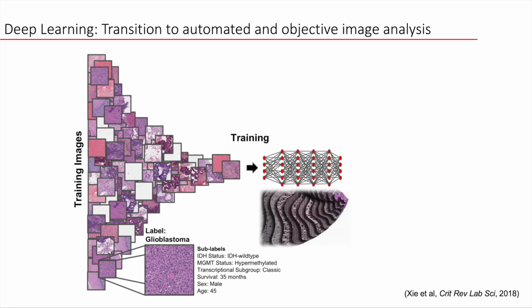So around that time, there were transformational improvements in another form of computer vision technology known as convolutional neural networks. And this is just a picture showing what the workflow for these deep learning tools looks like. The idea here is that instead of trying to manually engineer these discriminatory features, you can instead take advantage of large image data sets that are labeled.